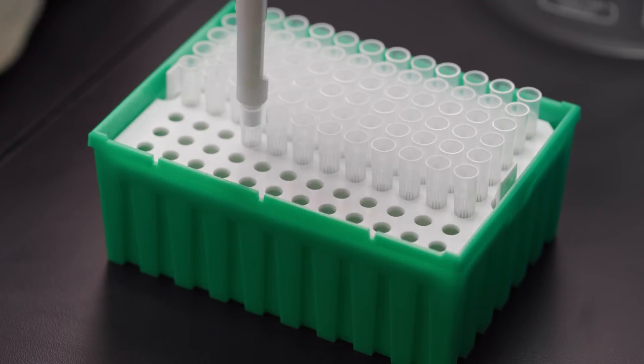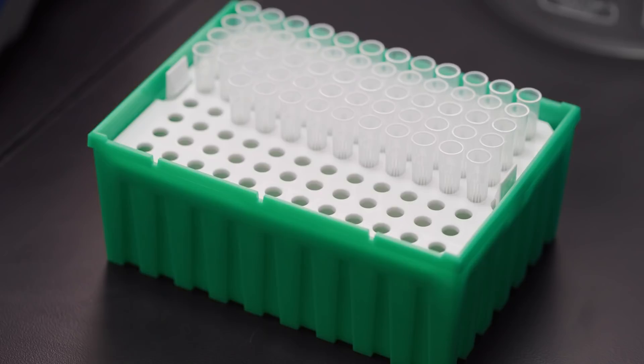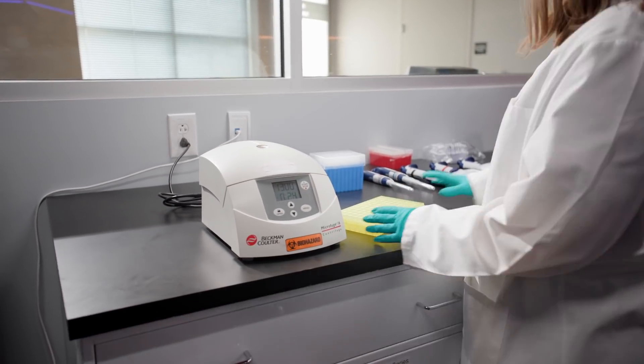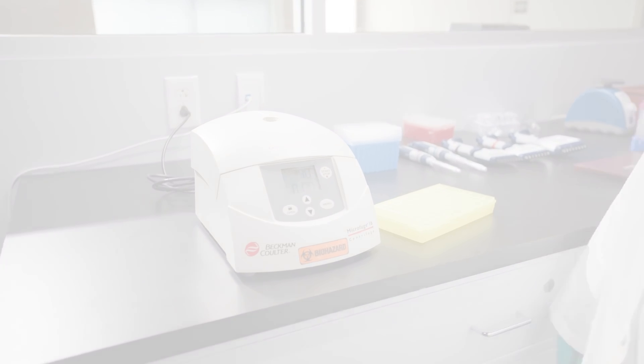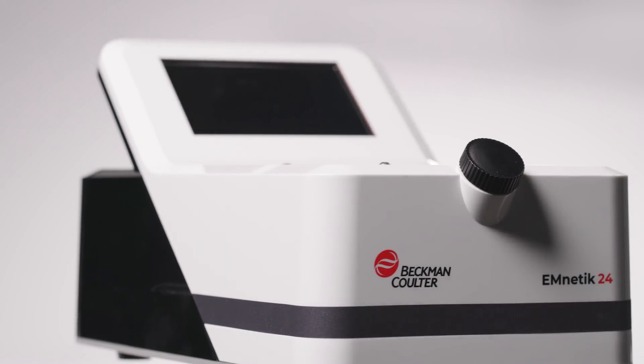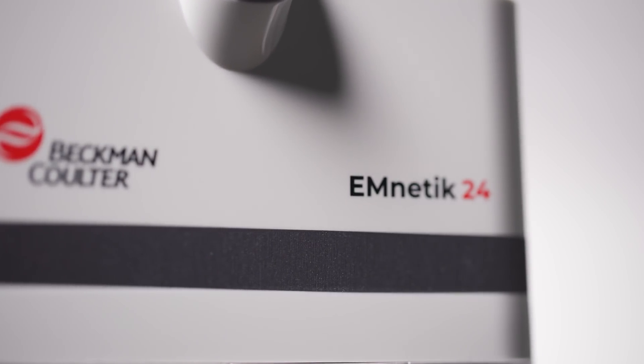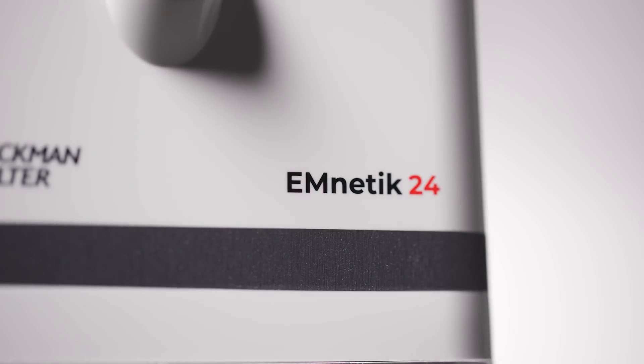30 years later, you're still using the same kit. It's time — time to do away with the old and update to a faster cleanup. The Mnetic 24 is two times faster than columns, only requiring 50 touchpoints versus the 300 touchpoints from column cleanup.